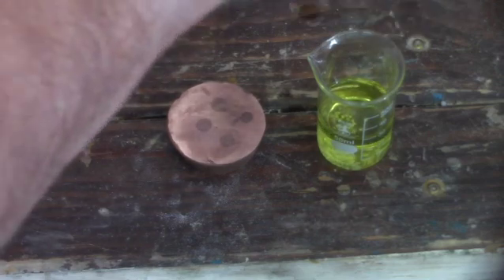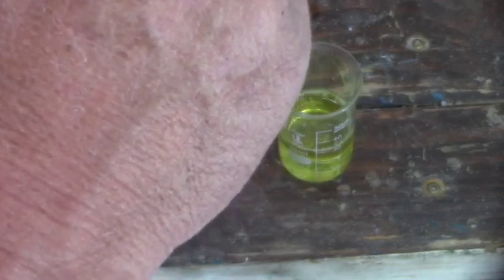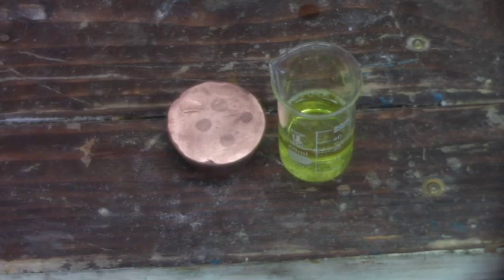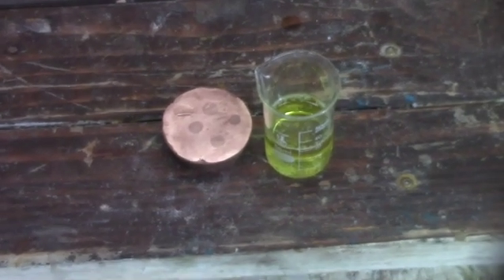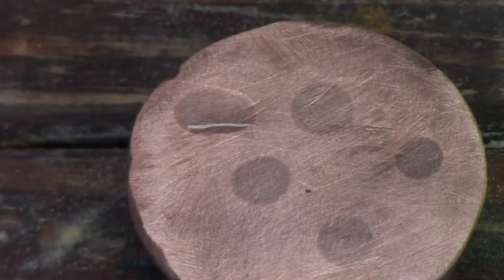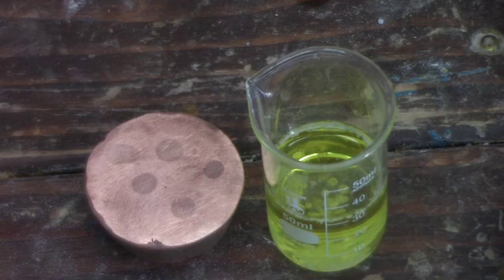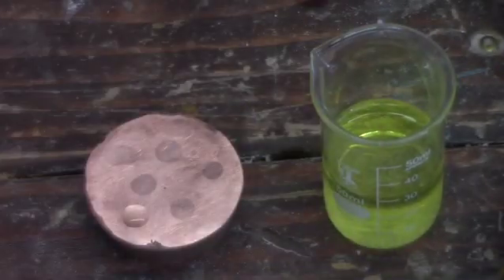We're now adding our third dose of urea and we'll give that a couple minutes to dissolve. We'll take another drip sample, place it on our copper, and see what the results are. This strip is in the upper left-hand corner of the disc, at about the 10 o'clock position. I've added some more prills and we'll let those dissolve and give it another try. This is our fifth addition of urea to the mixture. We'll now take a drip sample and put it on our copper puck.